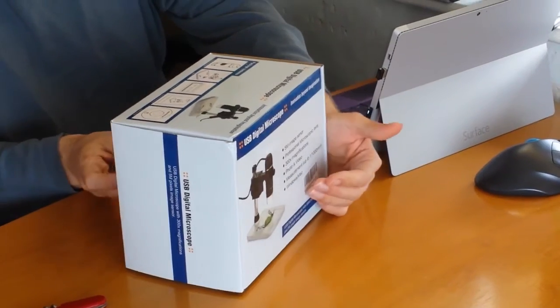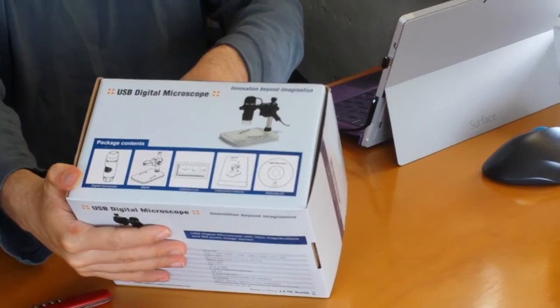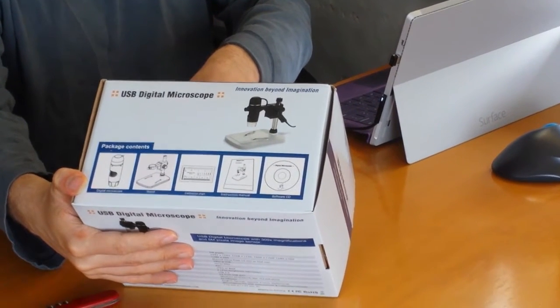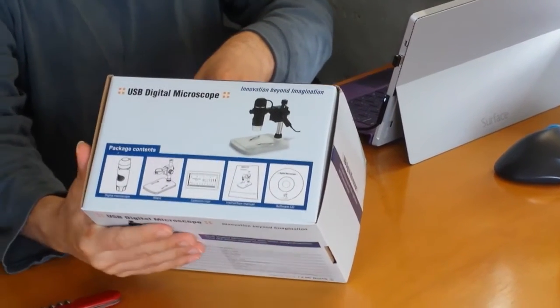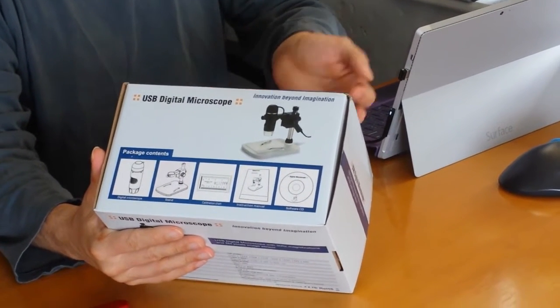We've got a USB digital microscope - obviously a different brand and a totally different style. This one has actually got a little table underneath instead of that awful tripod the other one had. It says on the box: five megapixel image sensor, professional microscope lens, 300 times magnification, photo and video so we can get snapshots and record.